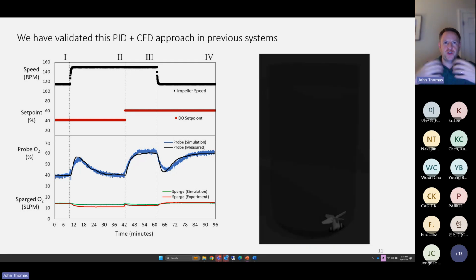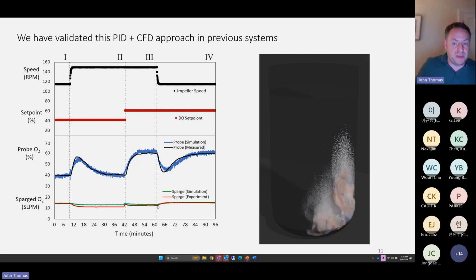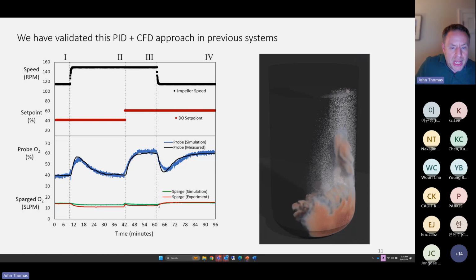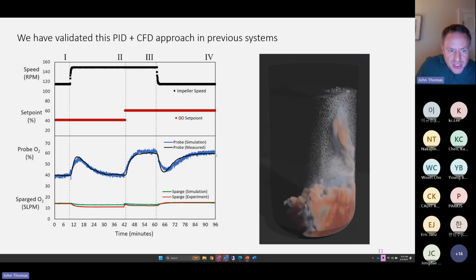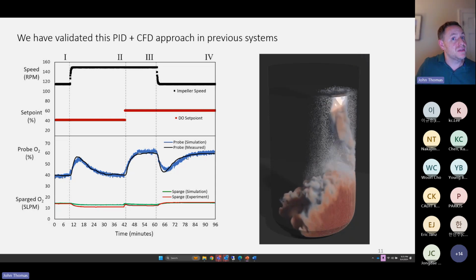There wasn't enough surface area, as it were, that allowed the KLA to match the oxygen set point demands. And so oxygen levels went down. They went down dramatically because the O2 flow rate was too low to supply the system with an appropriate amount of oxygen given the cell's consumption rate. How did the system respond? It gradually increased the gas flow rate until the actual DO level matched the target value after about 30 minutes.